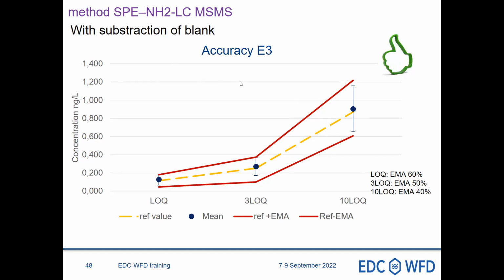It is a picture, in fact, that supports my talk just before. Here we have taken the liberty to subtract blank, even if it's not allowed in theory, but it's just to show you that, in fact, it's just a question of, we do not find a matrix without background. It's only, once again, the problem of finding blank matrices. So, in fact, in theory, the method is totally okay.